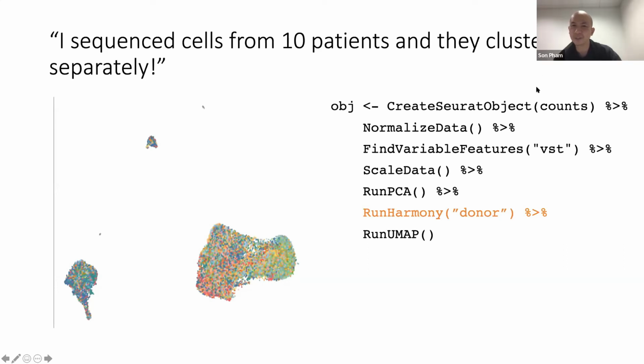Thanks, Ilya. The next question is, is there any assumption of non-linearity in the model at some point? Even though it says multiple linear model, it seems that there is more than just linear regression, some sort of topological modeling. Yeah. I mean, this was philosophically one of our interesting points, right? I assume that when you say topological modeling, you're saying that these data lie on a nonlinear manifold, right? And so you have t-SNE, manifold alignment, local linear alignment, all of these algorithms that are designed for manifolds rather than things that lie in Euclidean space.